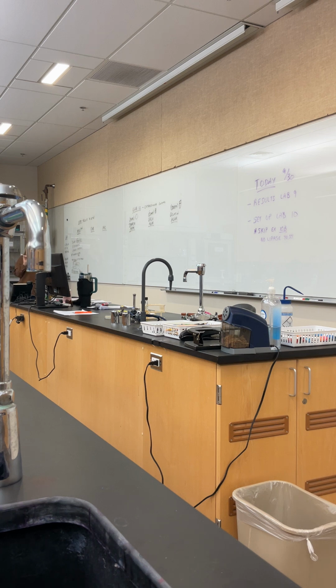Now, we tested 2 other bacteria on this media. We tested E. coli and we tested Proteus. How did they do on mannitol salts? Did they grow? No, we shouldn't see any growth. The reason we don't see any growth is E. coli and Proteus cannot handle the salt. So in this case, I'm selecting out organisms that can handle salt.